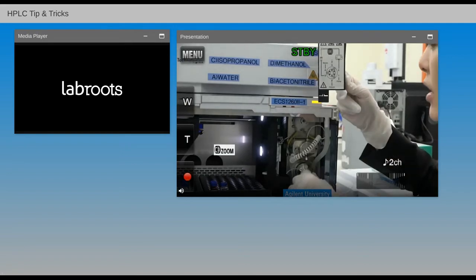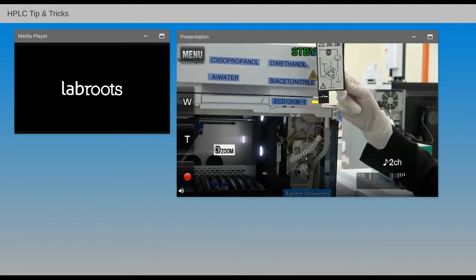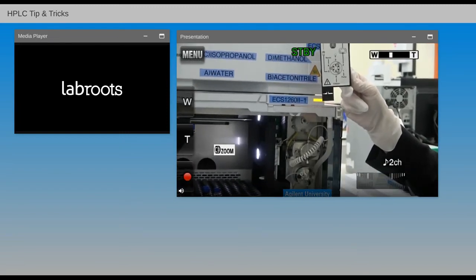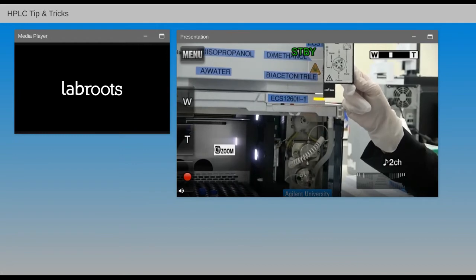Meaning to say that there may be a choke in the injection valve in this groove here. So you may want to consider taking this groove out to check, or change to a new one. But if the pressure drops, meaning it's not along the valve here, it could be due to the needle or needle seat. When you unscrew it and the pressure drops, it means it is safe along the groove here and the pump. Then it could be due to the needle or needle seat.